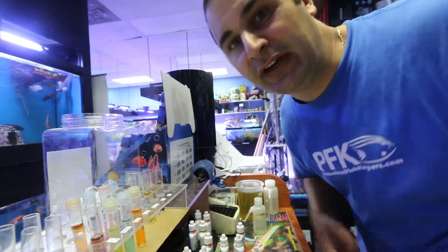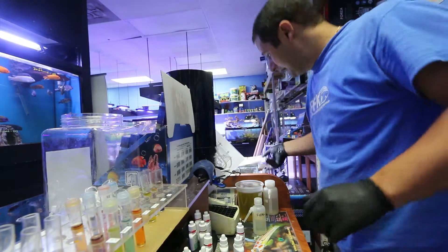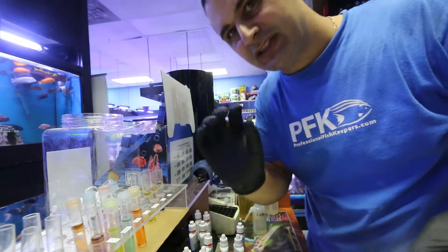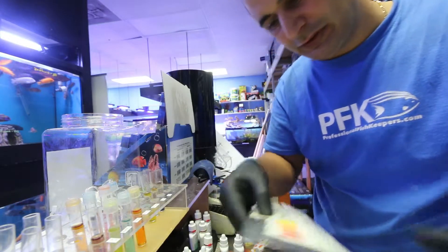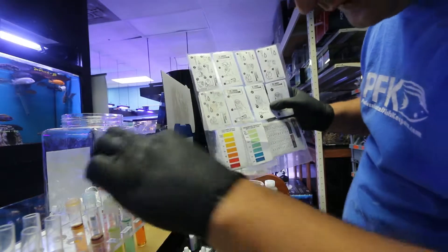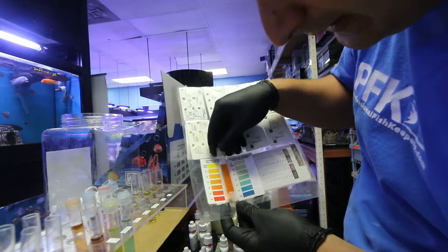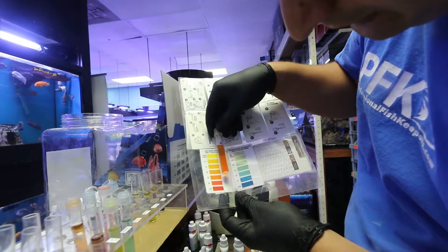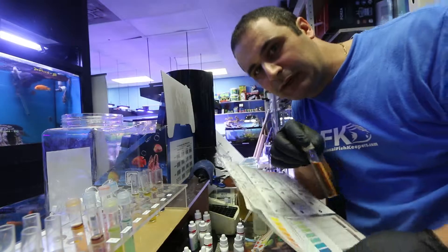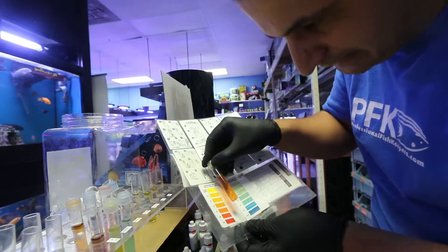Five minutes are done. I can see on this system the nitrates are starting to creep up a little bit. To read the nitrate result, you hold the color chart up against the tube and compare. From what I can see, the nitrates on this system are at 20 — the camera colors may look a bit different depending on the light, but my eyes read 20.